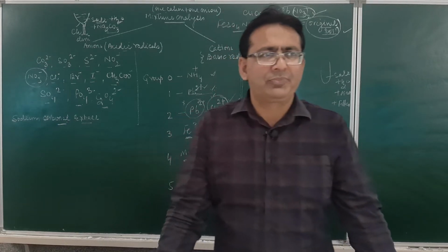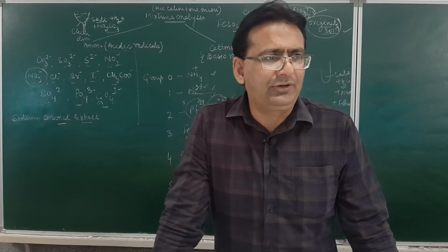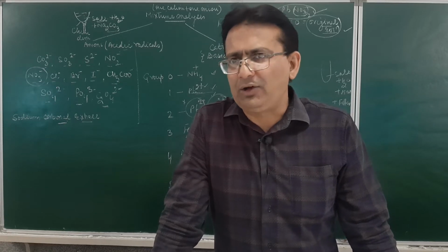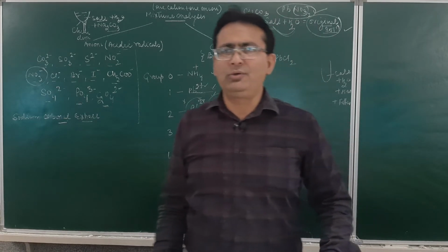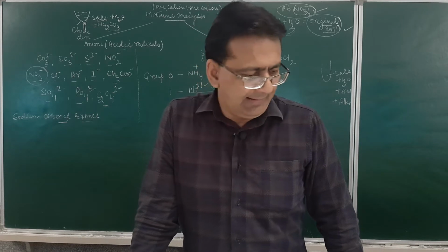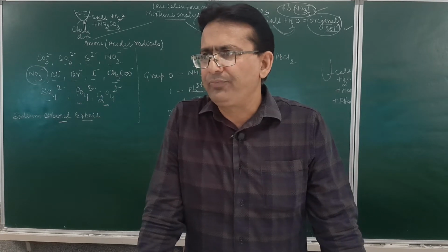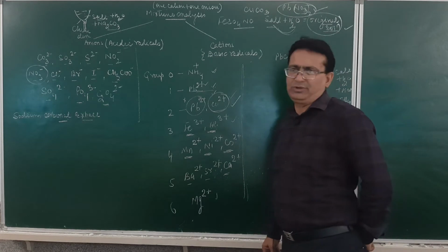Good morning, students. By now you must have seen that we have done two types of practicals with you. The first one was the titration, in which we did the ferrous ammonium sulfate versus KMnO4 and the oxalic acid versus KMnO4. The second was the organic analysis, in which we did various types of organic compounds. Now today we will be doing mixture analysis with you, students.